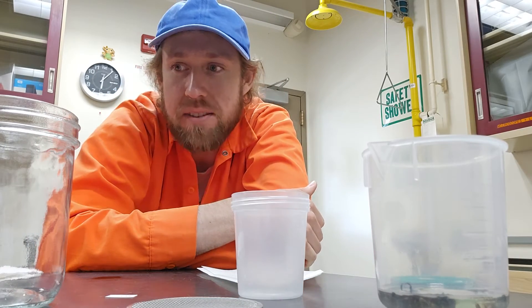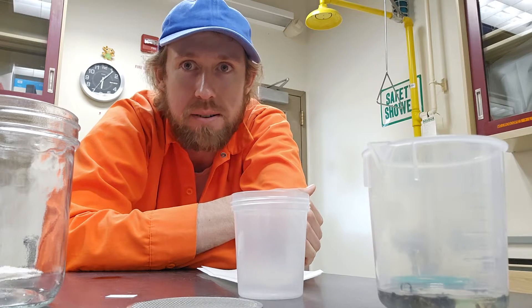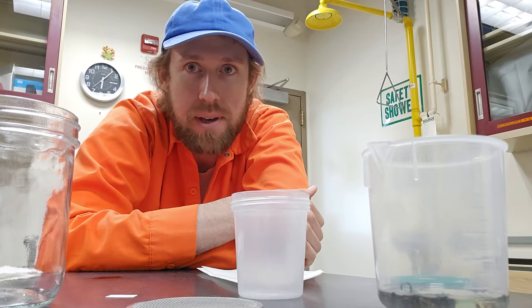Howdy y'all. I've got a new method for drying bees that have been collected as part of a monitoring program or really any collecting.